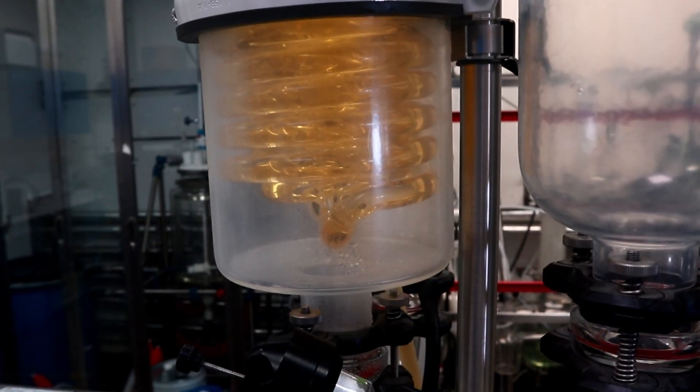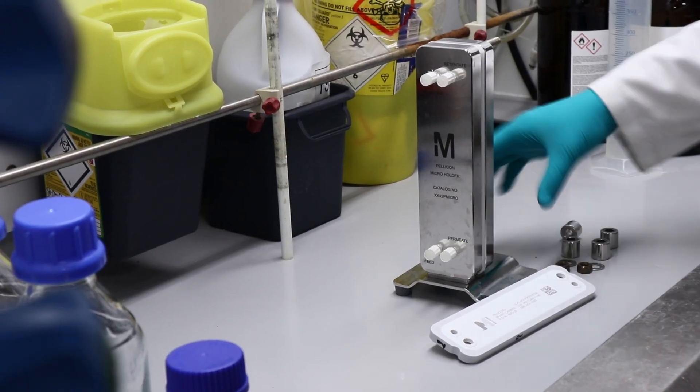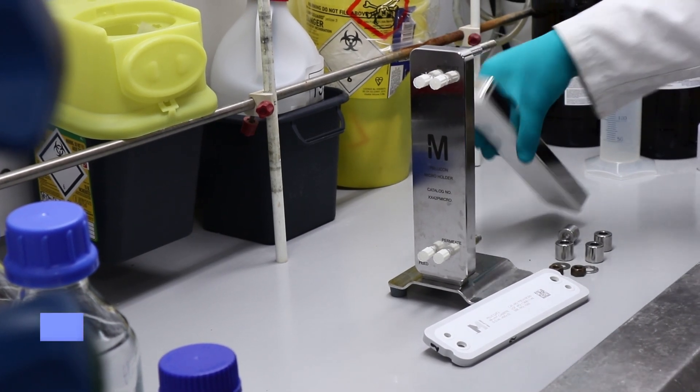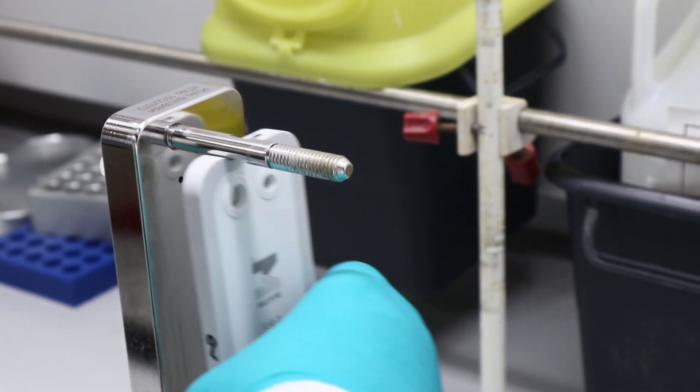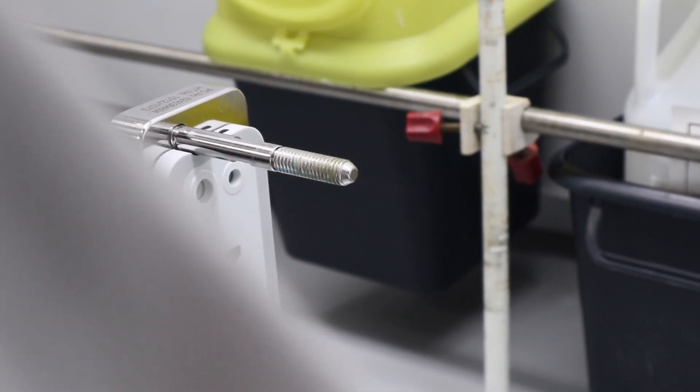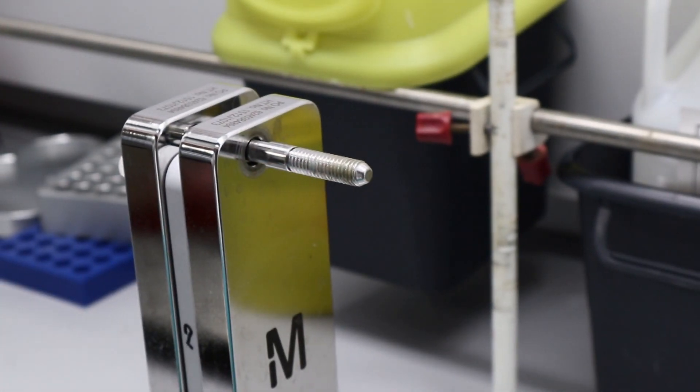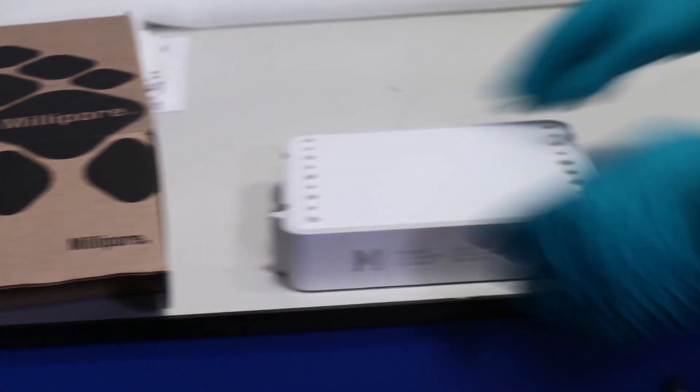We apply a range of purification techniques as specific projects require. For example, with ultrafiltration we can successfully remove low molecular weight impurities using membrane technologies. The purification is developed on a small scale and the filtration is modeled to determine the area to be used on scale and finally demonstrated on large scale.